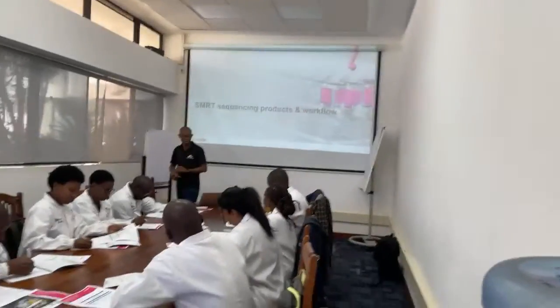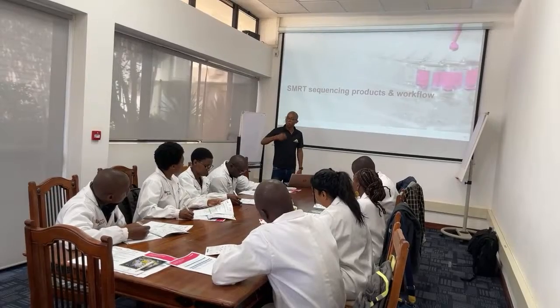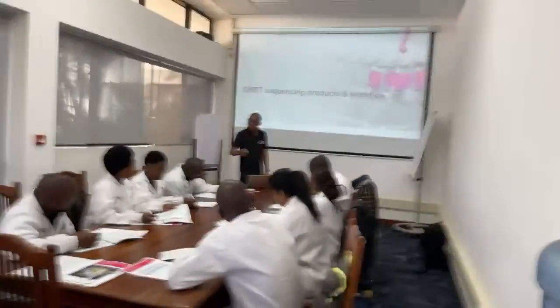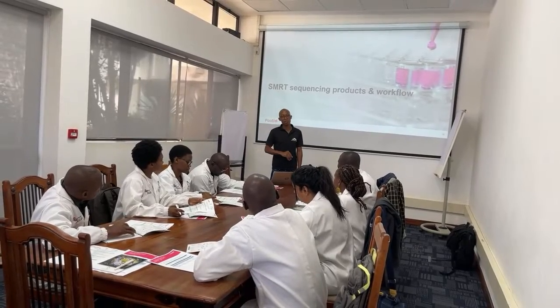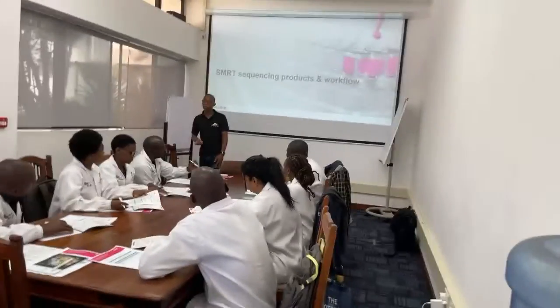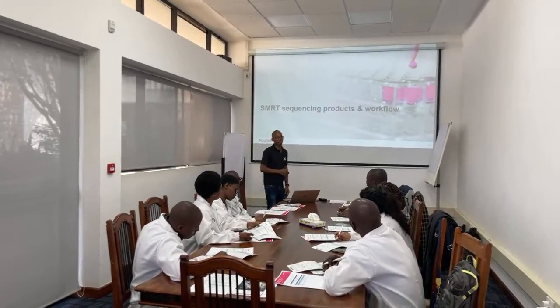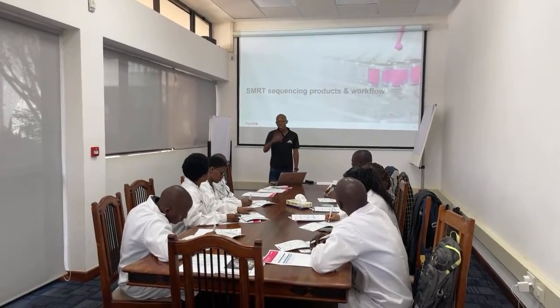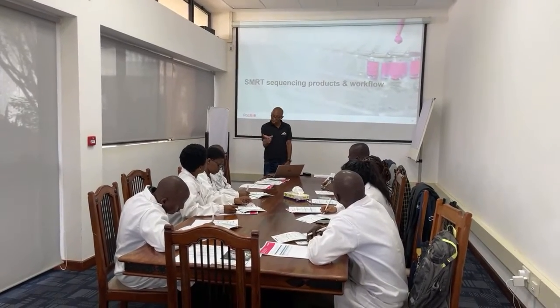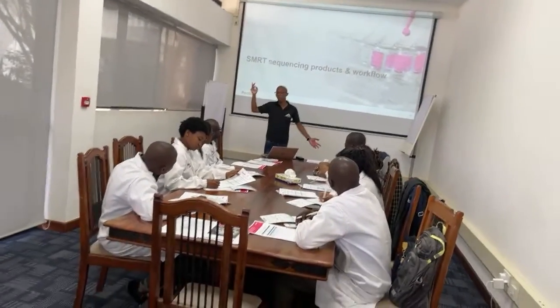The normal extraction, Zymo, Qiagen, where you use beads to bash the DNA, fragments the DNA and produces roughly 10 kb fragments. Not ideal for this, and too short for producing HiFi data. And the thing with PacBio technology is if you have shorter fragments, yes, you're going to have the highest quality of data because the fragment is so short that the polymerase reads it multiple times.